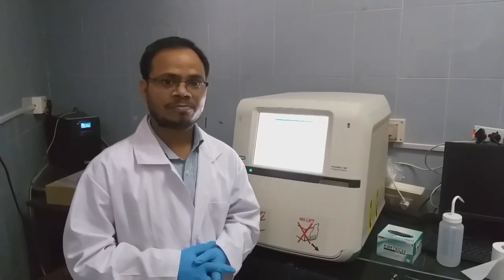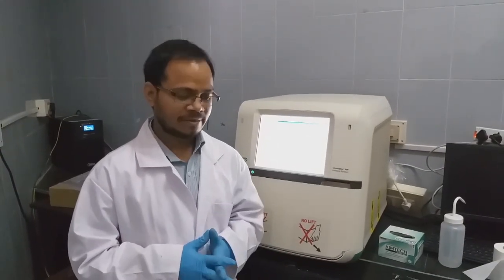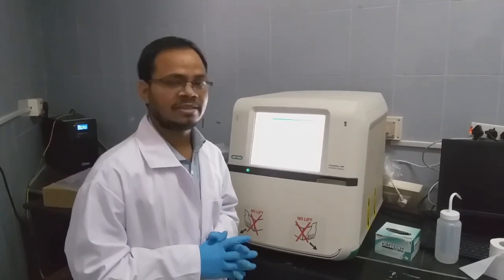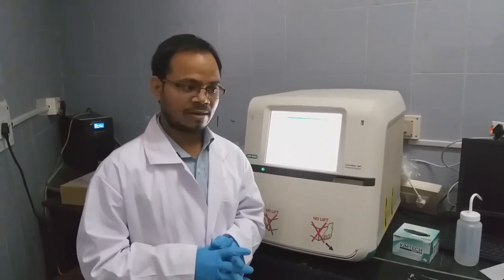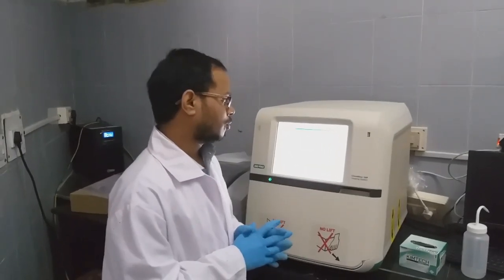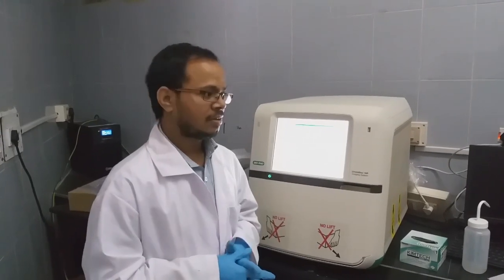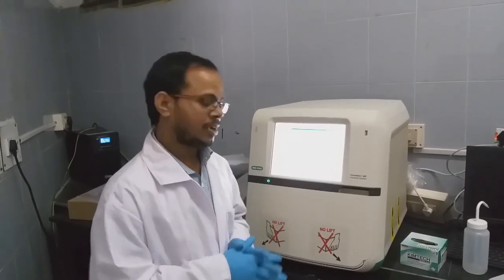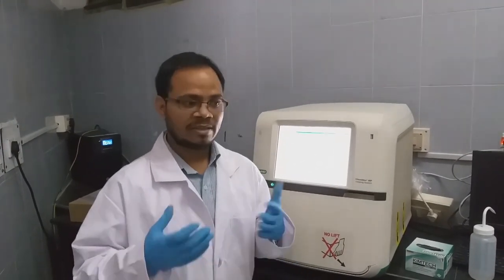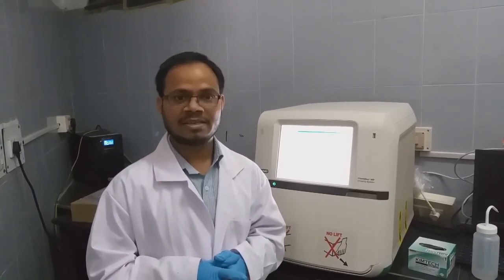In this video, we have learned how to prepare an SDS PAGE gel and how to run it, what are the precautions to be taken while preparing the gel, and how to observe and record the gel using the gel documentation system. So I hope this will give you a gist of how to prepare and run an SDS PAGE gel and analyze the protein sample.